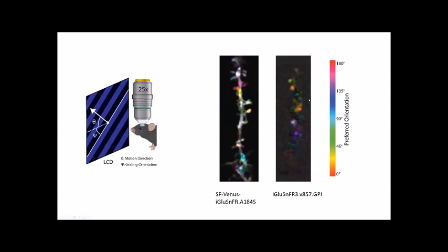Now, I do think that there are some differences between this variant and, for example, the corresponding green variant, and you should really read our preprint for details on this. But I think it goes without saying that this is a much more spatially specific and sensitive and non-saturating indicator.